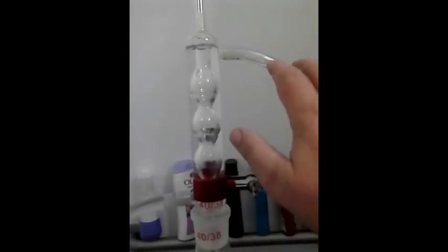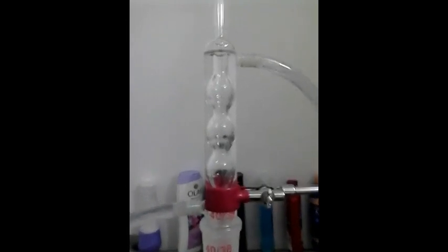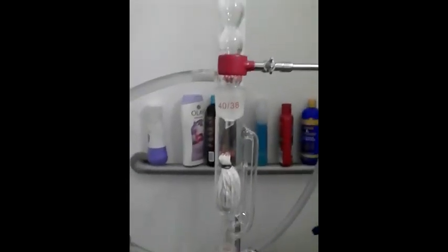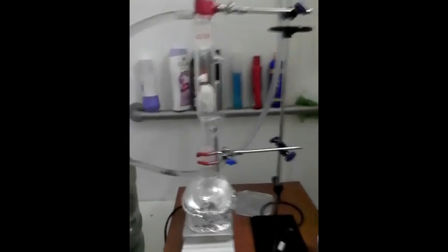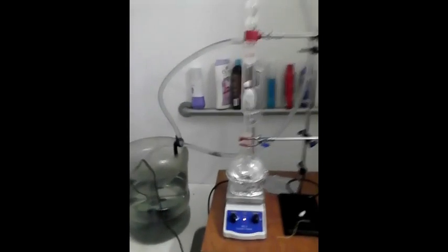Water comes in through here, fills up this tube, and goes down here. The reason why you don't want the water flowing down is it creates hot spots in this glass inside of the condenser, and it will make the glass prone to thermal shock and cracking — which is not good because it'll all drain back down here and it'll be a big mess. I'll let you know on the progress of it when everything gets going.